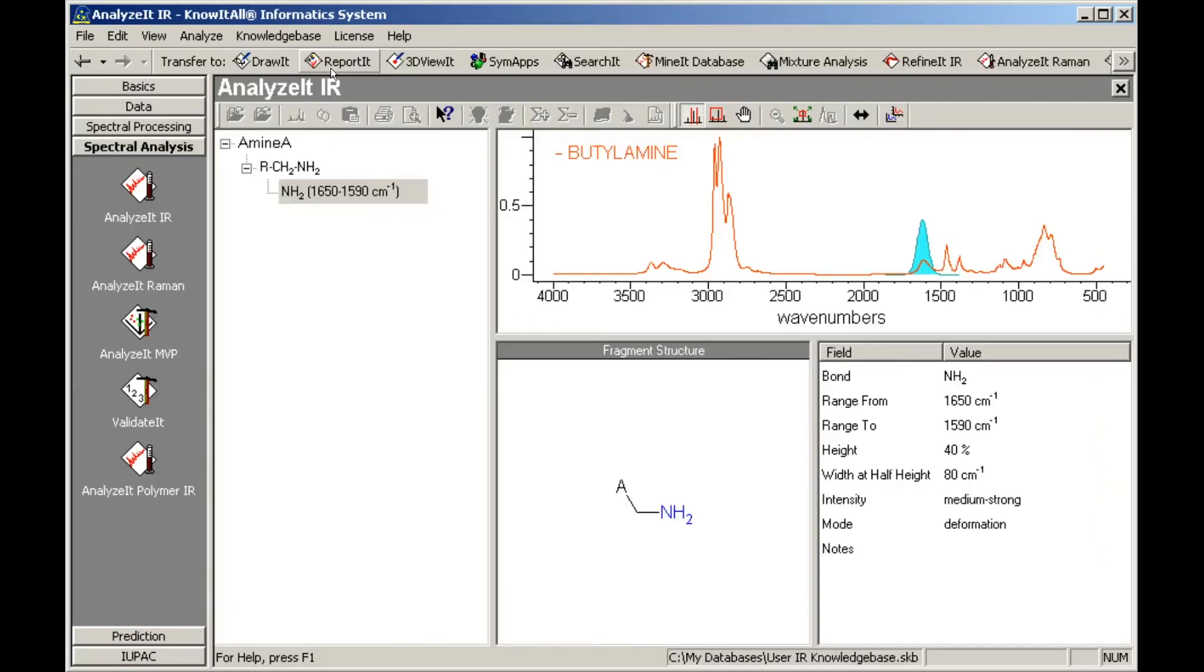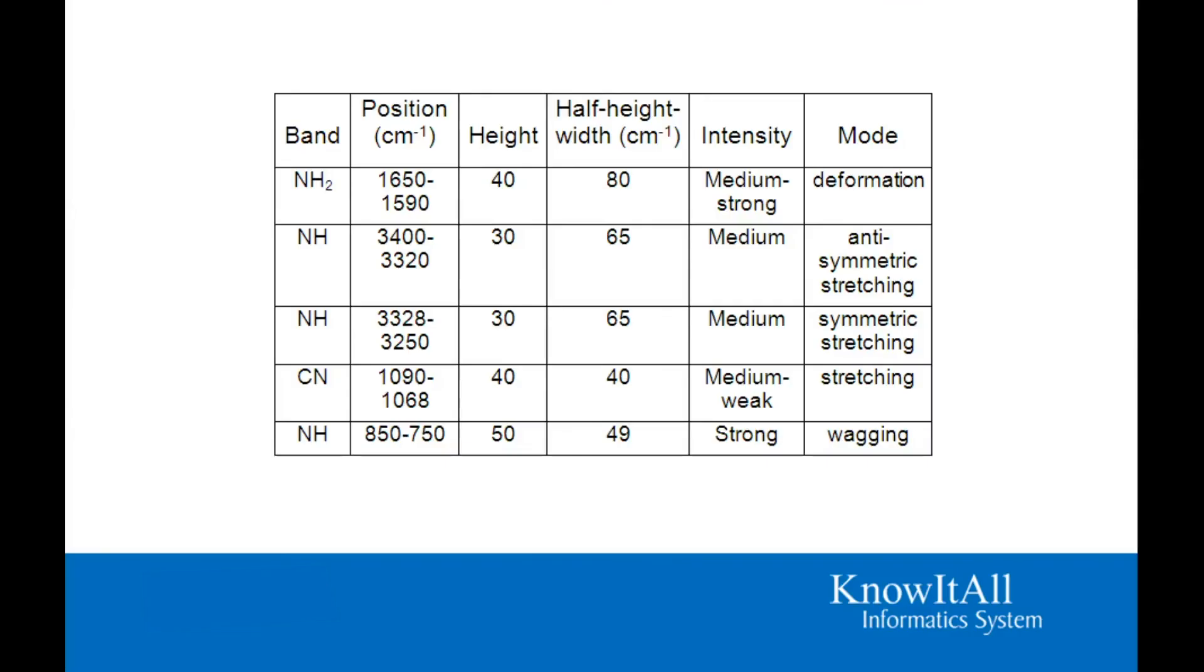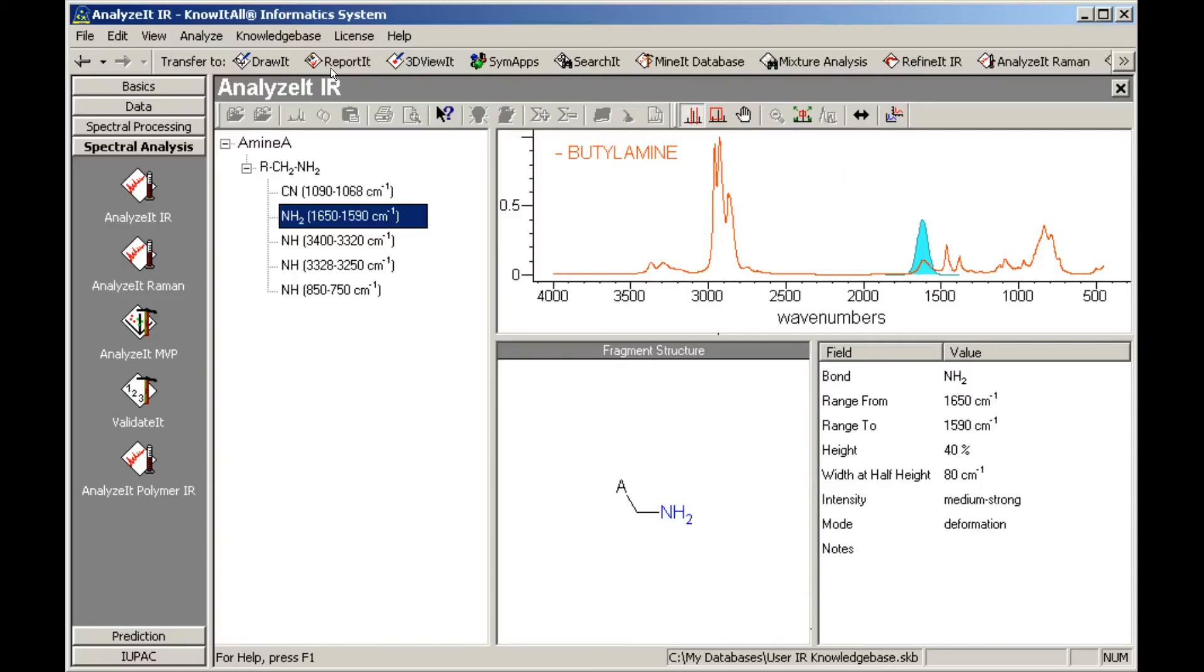The process can be repeated to add additional classifications, functional groups, and bands. After the other bands have been added, click the X button to close the user knowledge base, which is saved automatically.